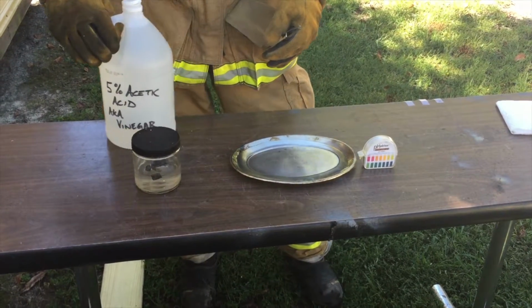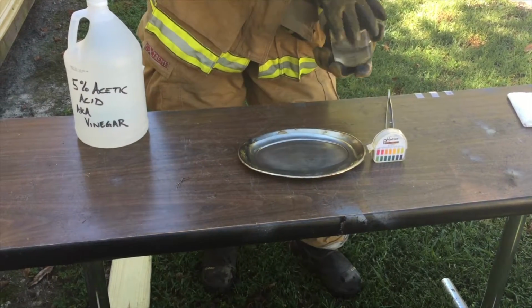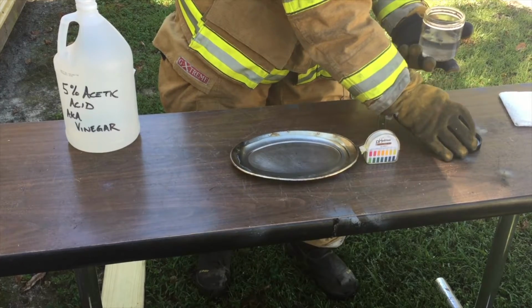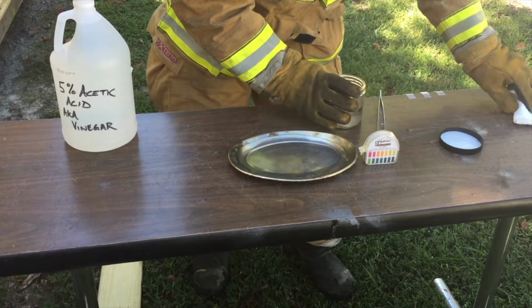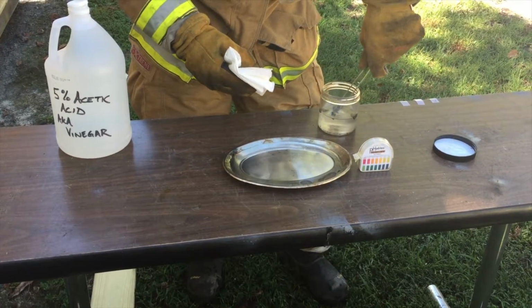The lithium and the sodium that we will use in this video are so reactive to water, even the moisture in the air may be enough to generate decomposition and fire. To prevent this from occurring, these metals are kept in oil to keep them dry during storage and transportation.